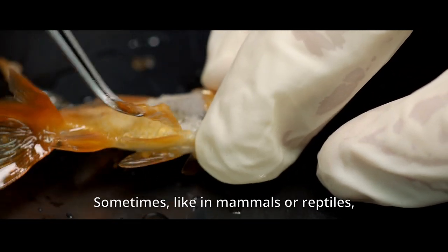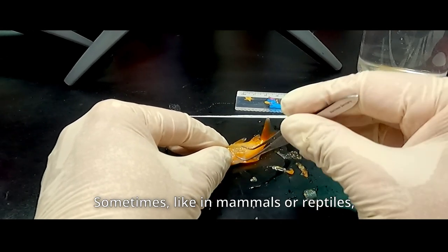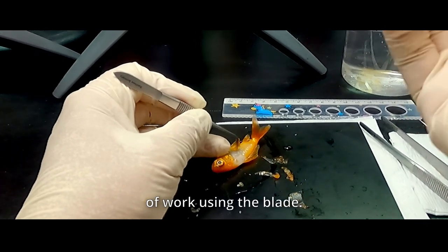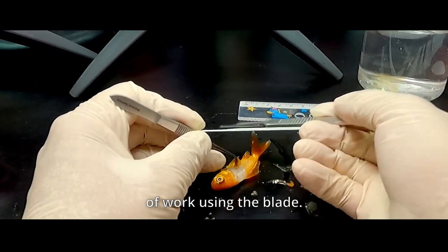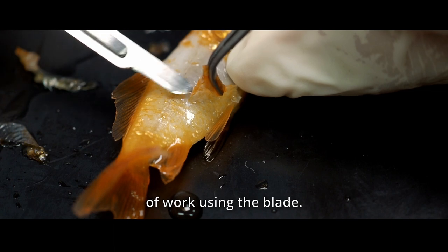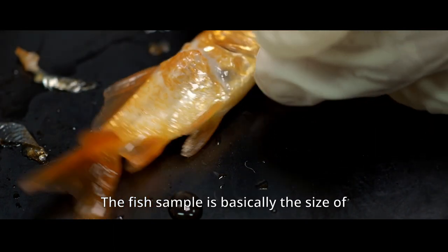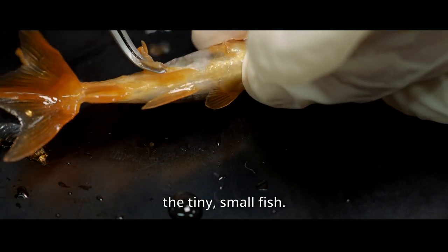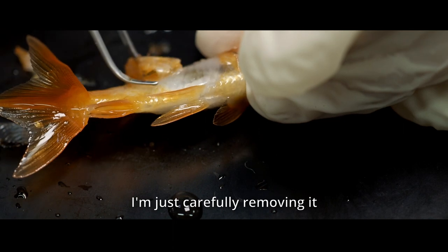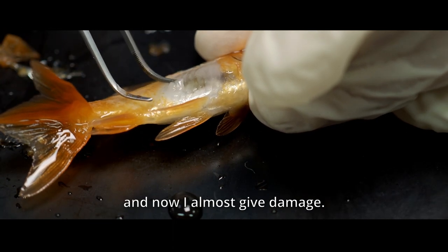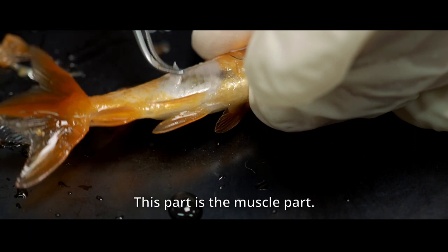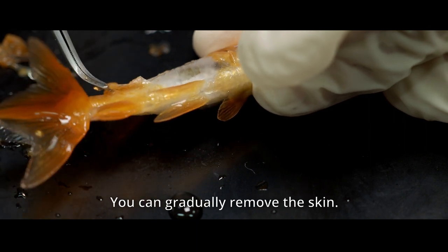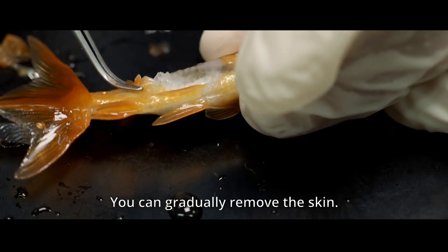Then, sometimes, like in the mammals or reptiles, or really big sharks, you have to do this kind of work. Using the blade. But the fish sample is basic, especially this size of the tiny small fish. Just carefully removing it. And now, I almost gave damage. Like this. This part is damaged. It's a muscle part. And you can gradually remove the skin.